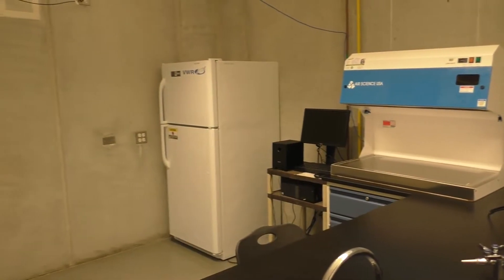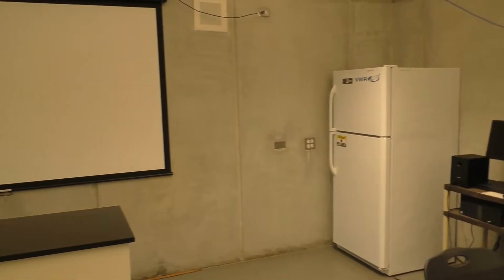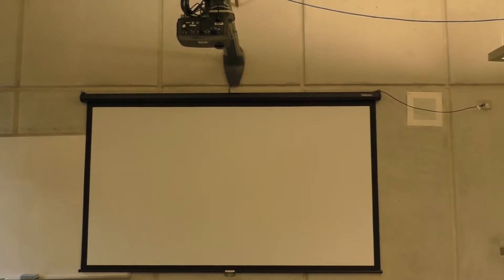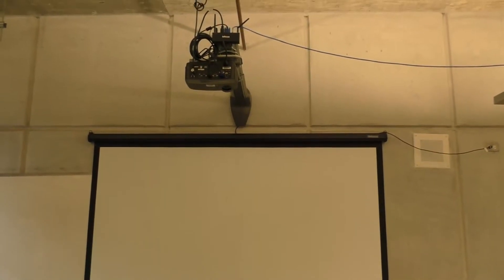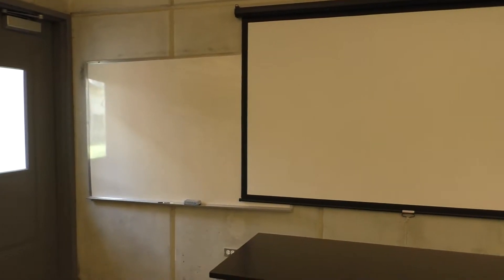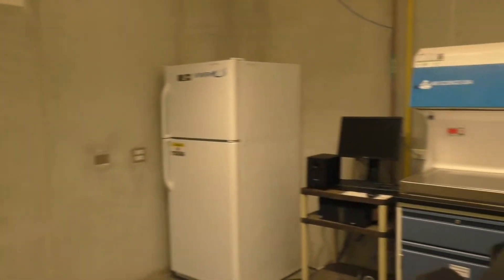The lab has the work area for the lab instructor consisting of a desk, a projection screen, a projector, a whiteboard, and a computer.